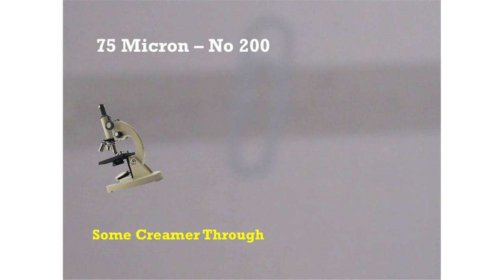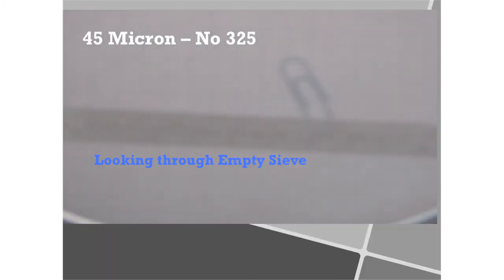Next, we observed a ruler and paperclip behind a 45-micron number 325 sieve. As you can see, there's only a faint shadow — the mesh almost completely stops the light.